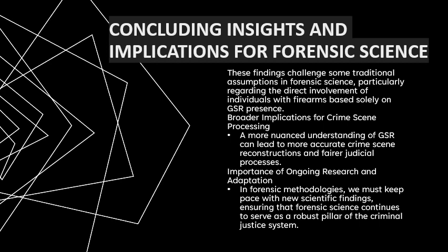Okay. We outline how acknowledging the dynamics of secondary gunshot residue transfer can refine the approach to crime scene investigations, leading to a more accurate reconstruction and interpretation of those criminal events. These suggestions also give insights that should be integrated into standard forensic procedures and training programs to improve the handling, analysis, and interpretation of GSR evidence, and the impact on court evidence presentation.